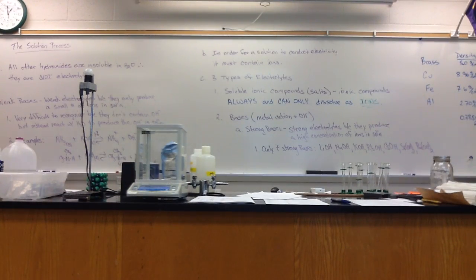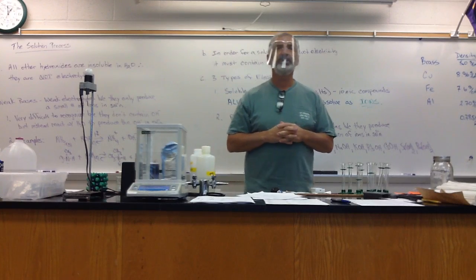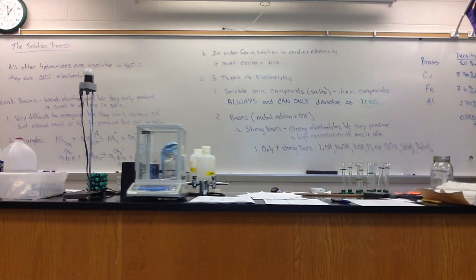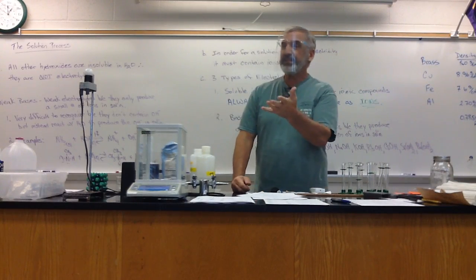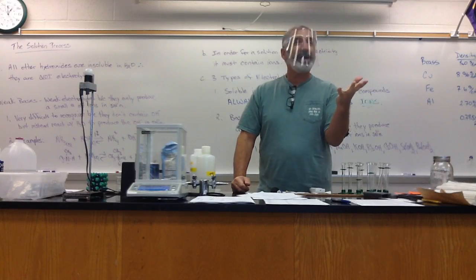Today we're going to do a lab, density lab, and what's density equal to? Mass over volume. And I'm going to go ahead and just move this out of the way. Since we want mass over volume, the first thing we're going to do is get the density of a solid. In your basket, in your tray, in your basket will work.